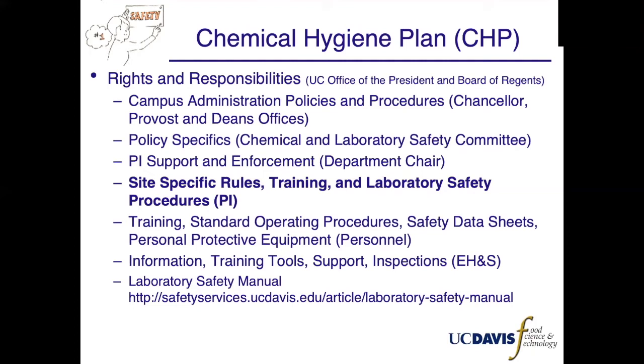Safety information, training tools, support, and inspections are the responsibility of the campus Environmental Health and Safety team. Again, this plan with all the detailed information can be found in the Laboratory Safety Manual.